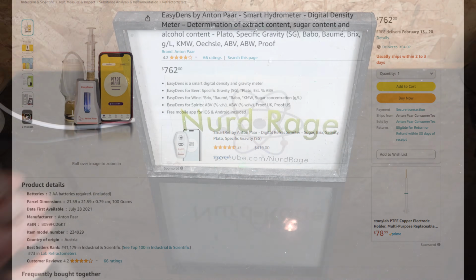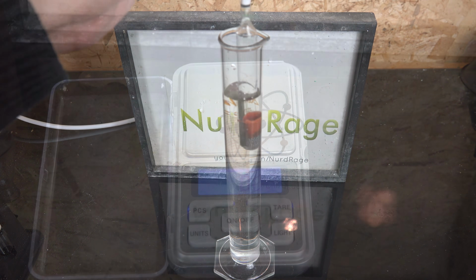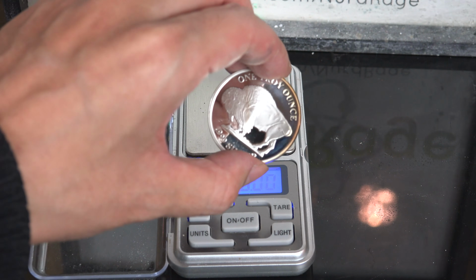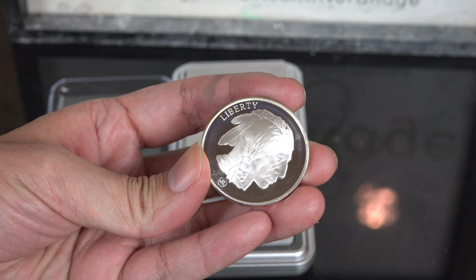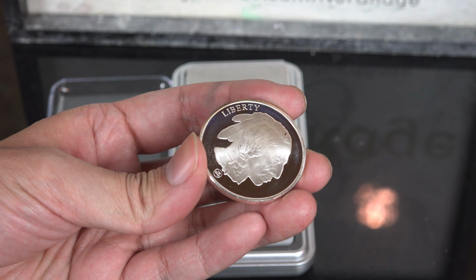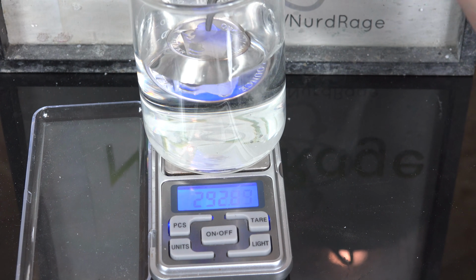Okay, so far we've been measuring liquids, but there are a few times when we want to measure a solid. The problem with a solid is that it's not always easy to measure the volume, especially if they are irregular solids. Fortunately, there are a couple of tricks. The first method is the Archimedes principle.